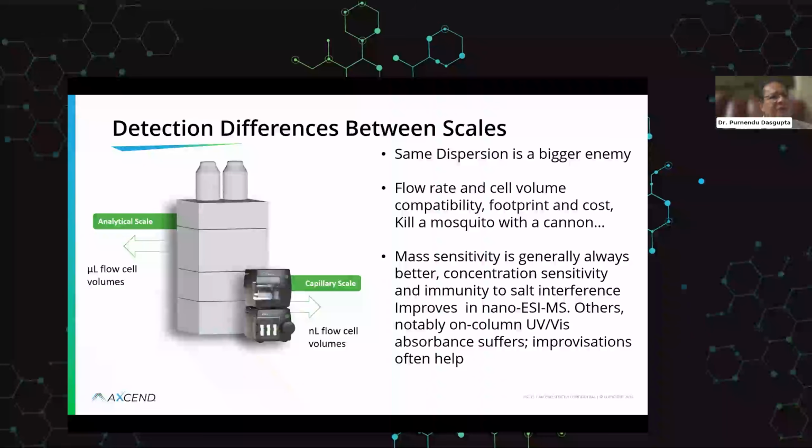Some of you have heard of nanopore detection, where the molecules pass through a very small pore and you can detect the passage of a single molecule quite easily, actually. What you don't always realize, they say, oh, I can detect a single molecule. So imagine you put a 1 milliliter solution containing a single molecule in the detector. How long will it take for that molecule to diffuse to that hole?